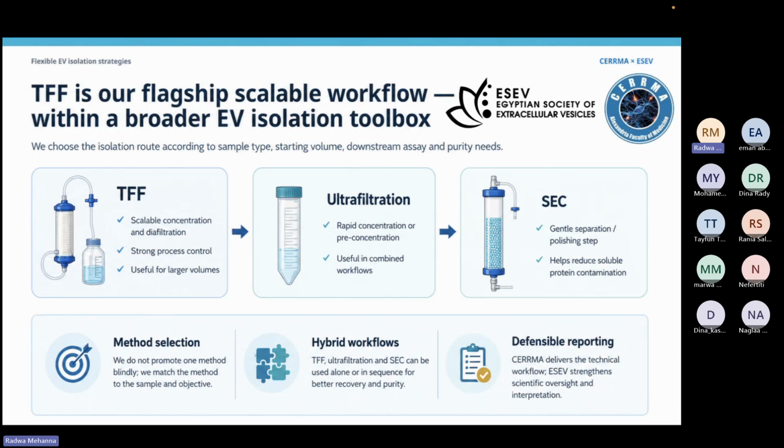Mainly the poor recovery, the contamination that can occur from the ultracentrifugation, that we find the EVs sticky, and the need of this ultracentrifugation equipment. All of this were real limitations when we were working with the EVs.